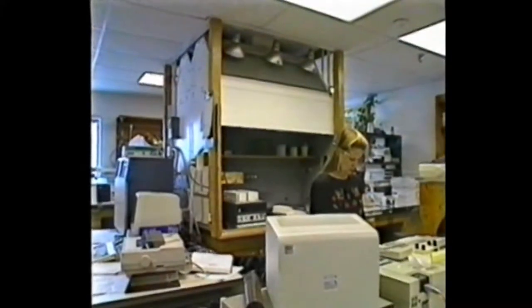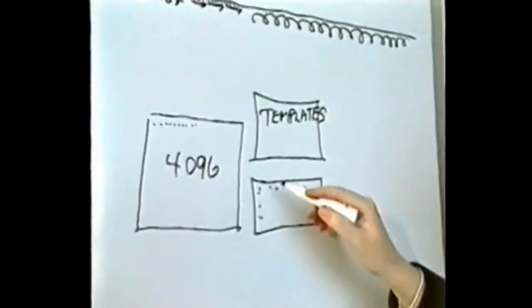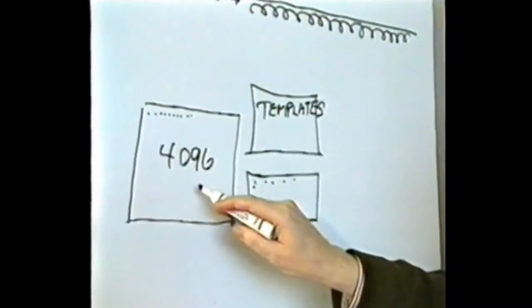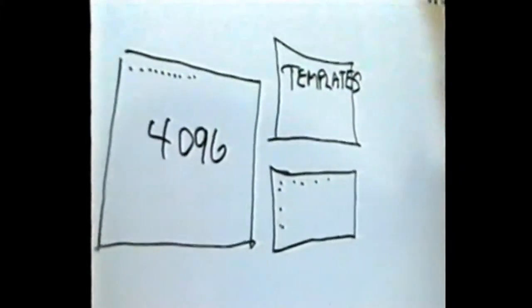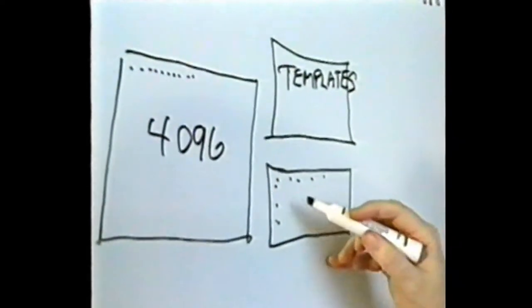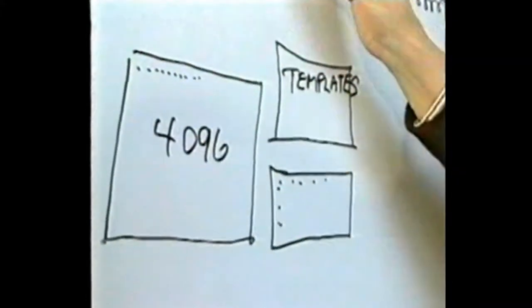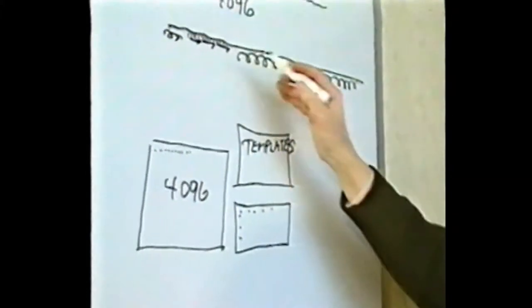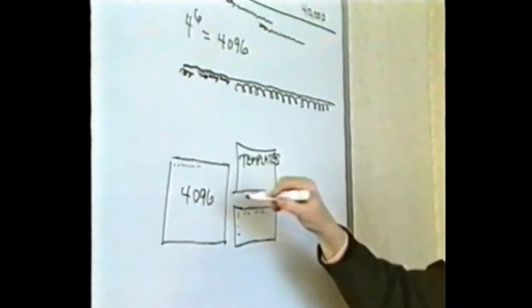To date, Studier's group has experimented with over 5,000 different priming sites, and the hexamers seem to be as effective as the 18-mers. So having the ability to prime at specific sites from a library of hexamers means that you can automate this process by having an array of 4,096 hexamers, a set of templates on which you're walking in parallel, and a place for assembling sequencing reactions. So a robot could go take an individual template and the 3 hexamers that prime at the position on that template that you are wanting to read sequence, and the robot can assemble reactions as fast as it is able.